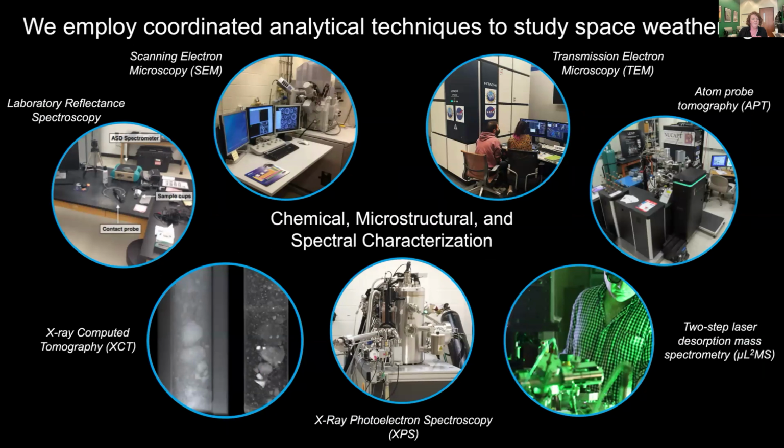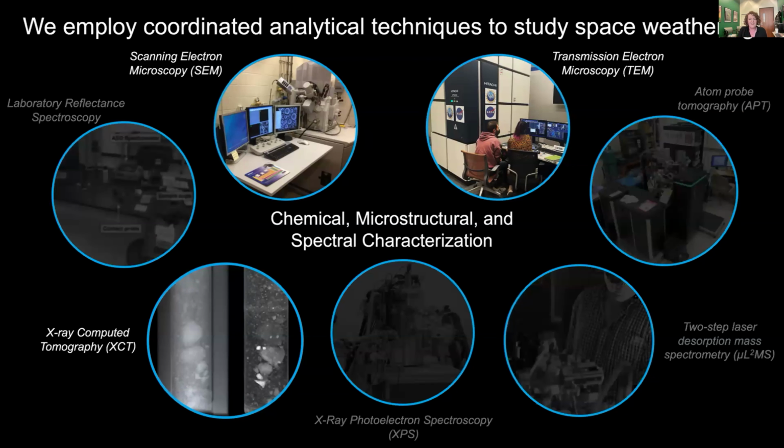So in my work, I use a lot of transmission electron microscopy, atom probe tomography. We study organic species with two-step laser desorption mass spectrometry, XPS, X-ray computed tomography, laboratory reflectance spectroscopy, and then of course, scanning electron microscopy. It really takes all of these tools to get a coordinated understanding of the samples. Today, I'm just going to talk about data from 3 of these techniques, which I thought would be of most interest to this group, including SEM, TEM, and XCT, or X-ray computed tomography.